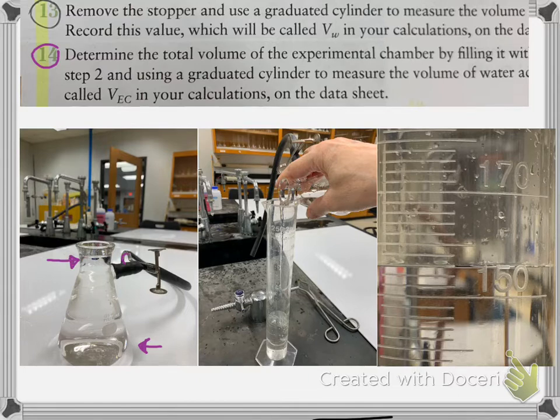Now notice I had to take a clamp right here because we didn't have the needle. If I would have left this open, the water goes flowing out. So this is just a clamp to make sure the water stays in the chamber. And then I filled it up. This was a very, very big graduated cylinder. And so now this is step 14, and we're going to record this. And this is the volume of the experimental chamber.